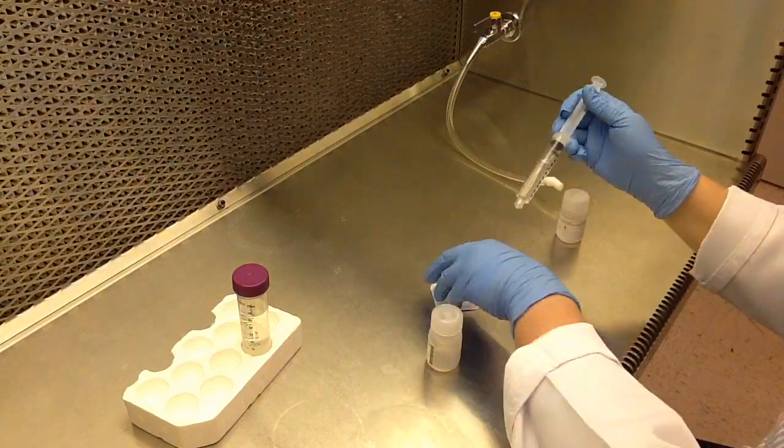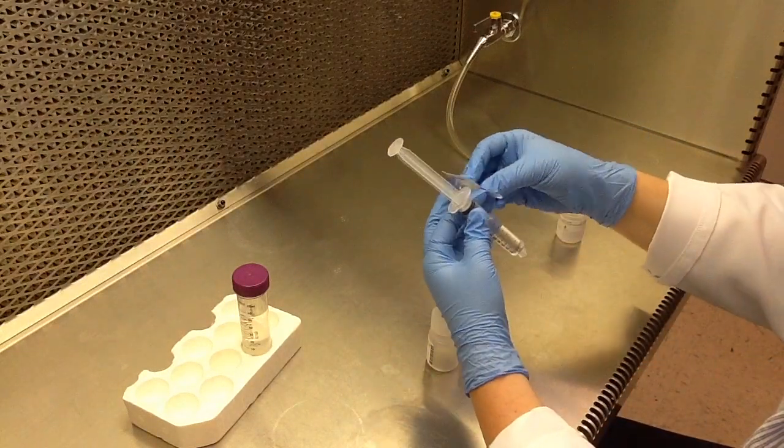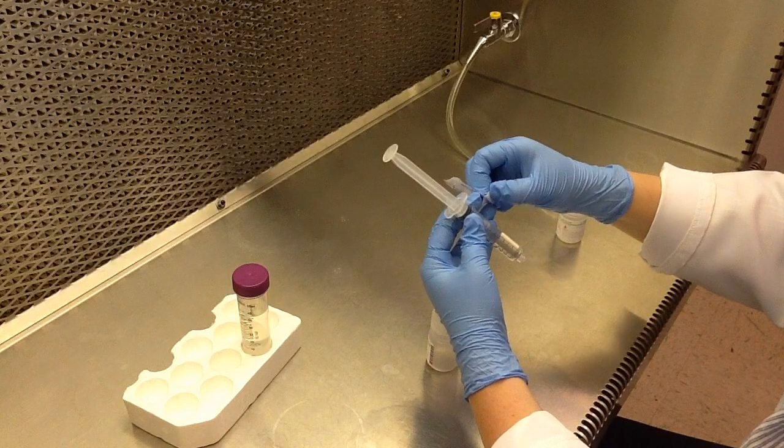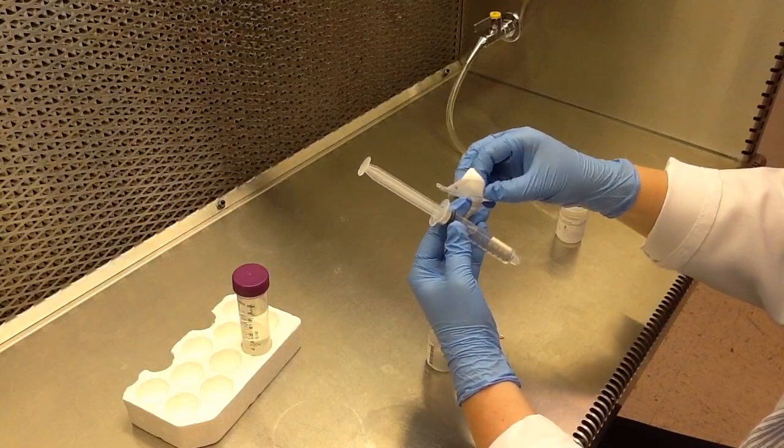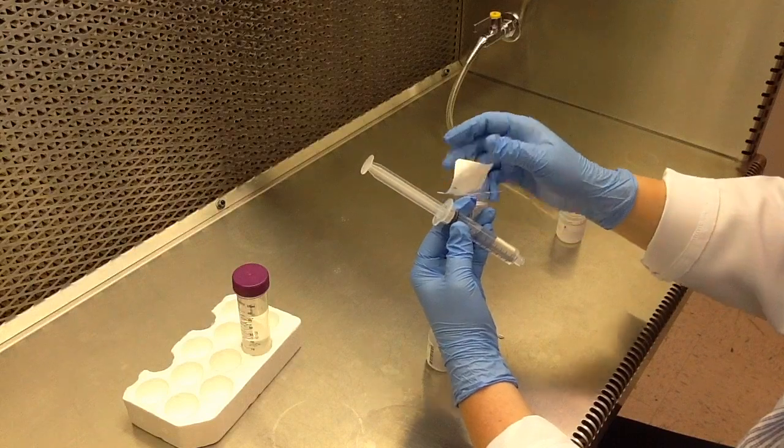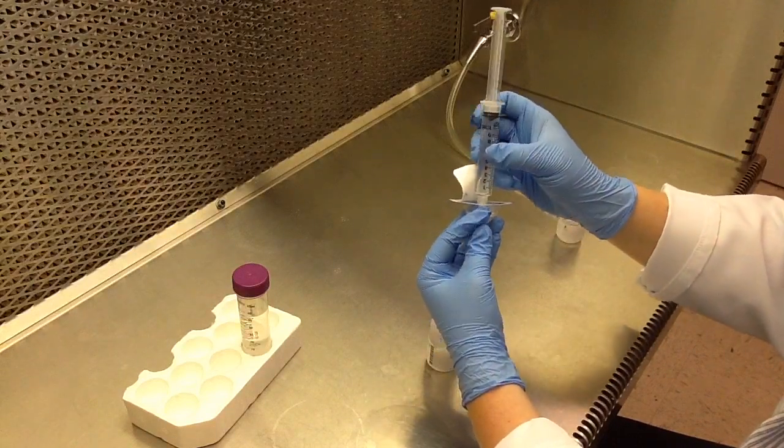Carefully remove the top of the sterile filter packaging. Do not touch the bottom side of the filter as you will risk contaminating your stock solution. Use the packaging to help you screw it on. Screw the tip of the syringe into the filter.